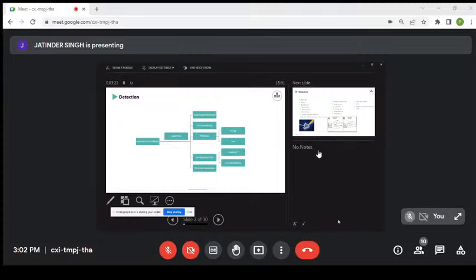Like if you do a COVID test with a lateral flow assay, you're not interested in how much COVID you've got. You've got it or you don't. A lot of applications where you actually don't care. Like if you're pregnant, you are pregnant or you're not. You can't be 10% pregnant. So there's a lot of applications where quantitation is actually not needed. Whereas there's a lot of applications as well where quantitation is really important because some things are only toxic above a certain level. So your application decides if your detector needs to be able to give you a quantitative answer or if a qualitative answer is good enough.